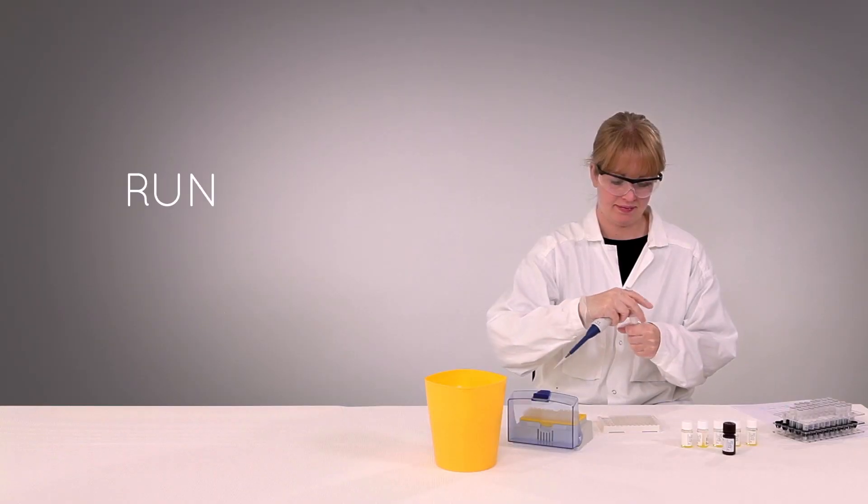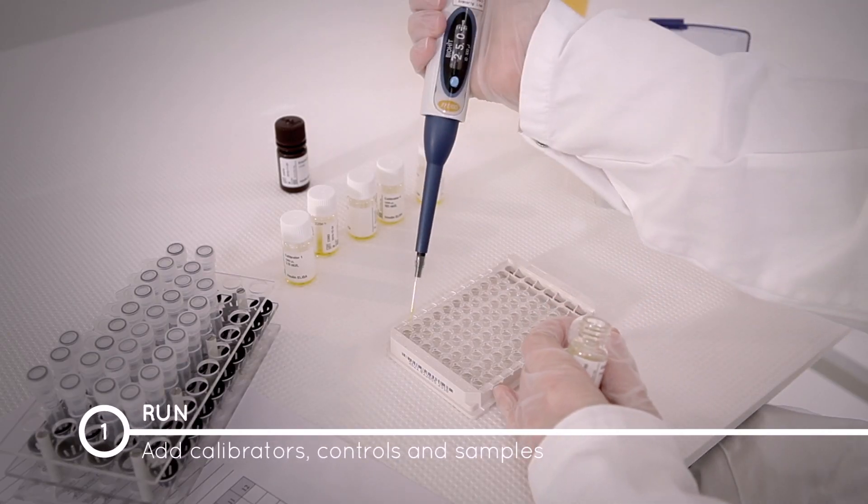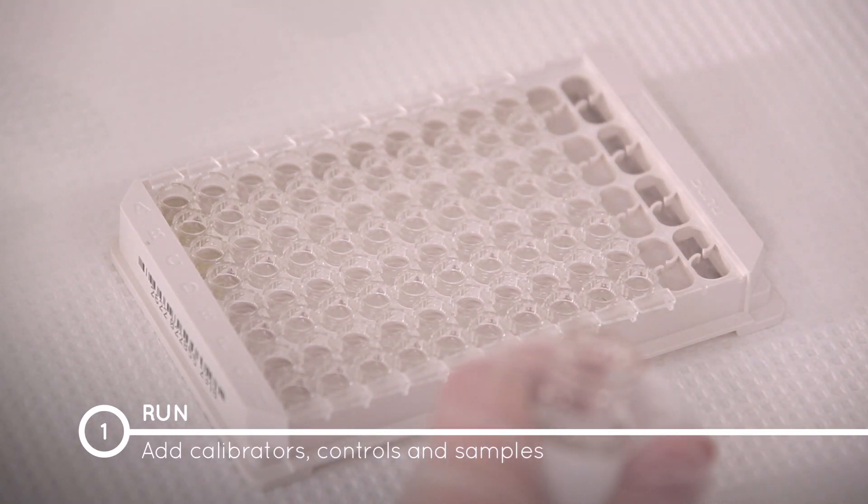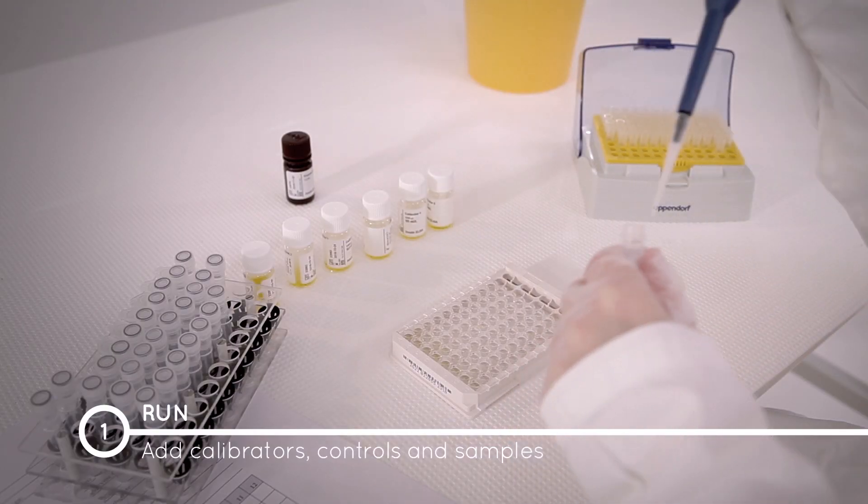Now, pipette 25 microliters each of calibrators, controls, and samples into the appropriate wells. Each calibrator, control, and sample should be run in duplicate for quality assessment.